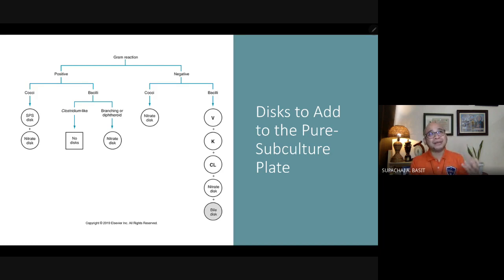Now that we are familiar with the sensitivity disks, we can add a particular disk depending on the gram reaction and morphology of the bacteria that we have isolated. For example, if we are dealing with gram-positive cocci, we should be using the SPS disk and nitrate disk.